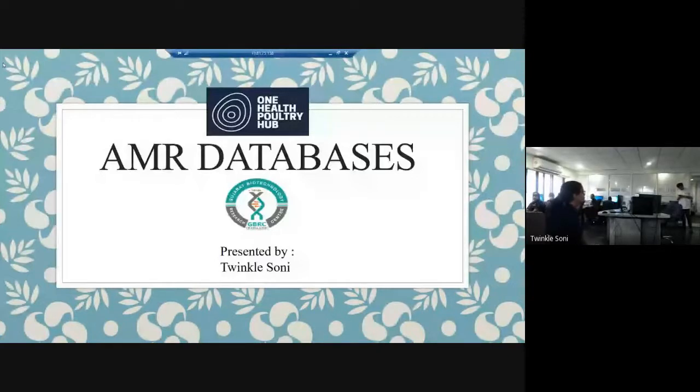So good afternoon, everyone. I'm Twinkle Soni, and today we are going to learn AMR analysis. Basically, in this presentation, I'm just giving you a brief. My main focus will be on hands-on.